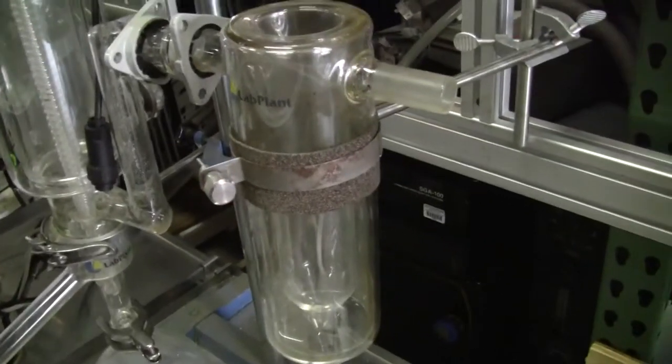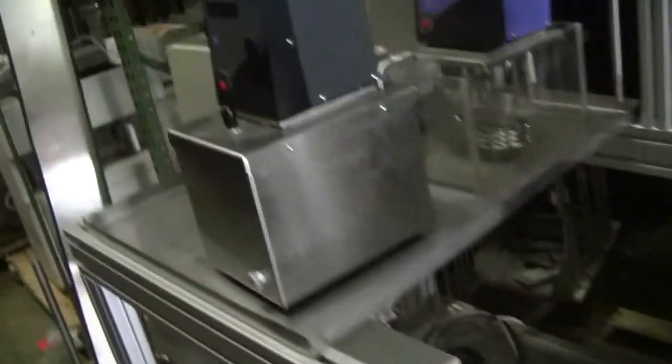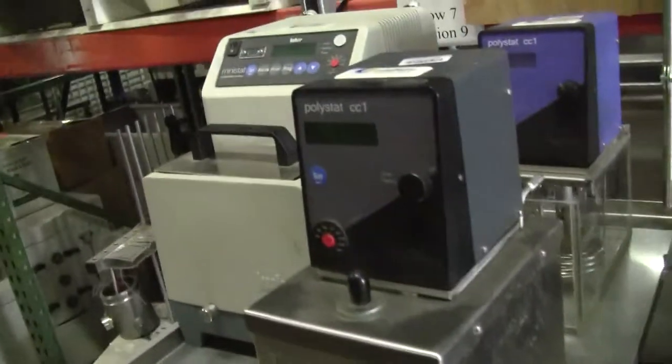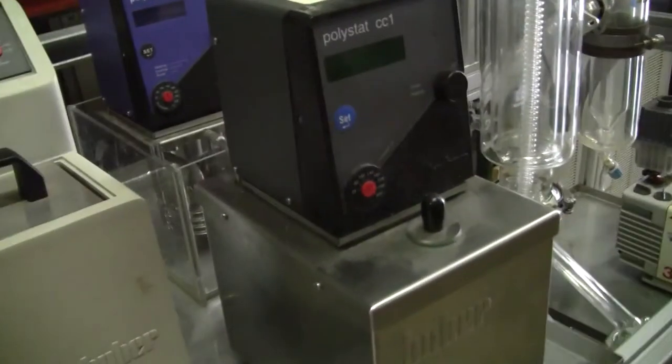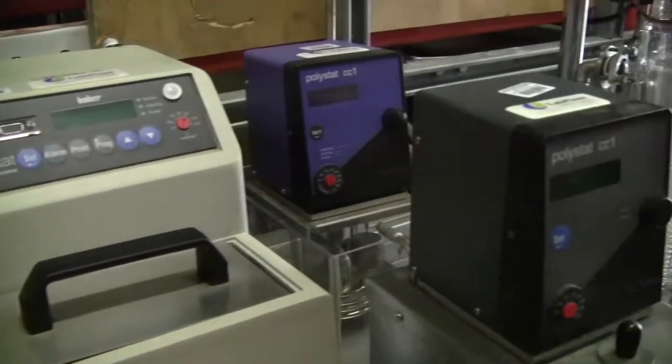Vacuum cold trap, vacuum pump. Over here we've got hot oil recirculators.